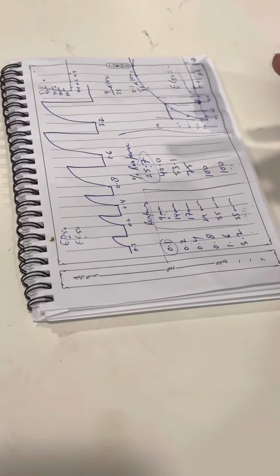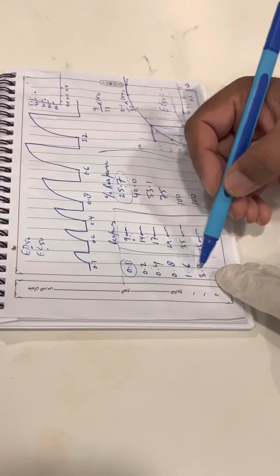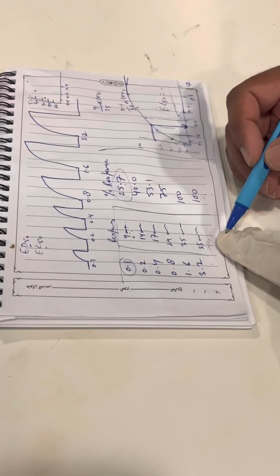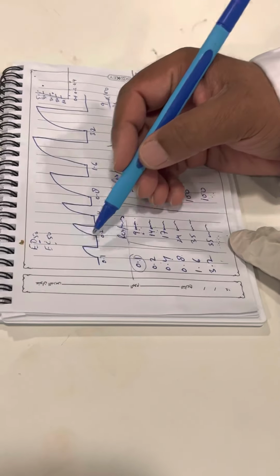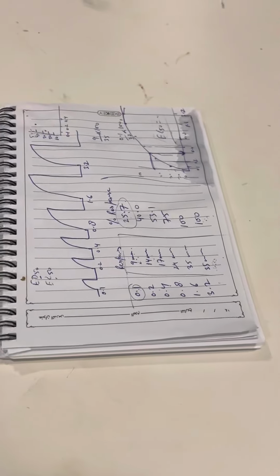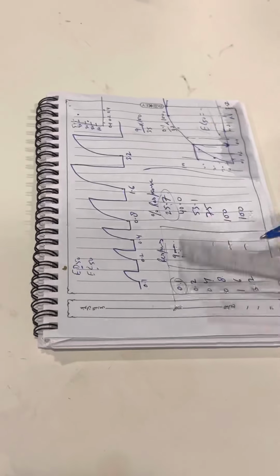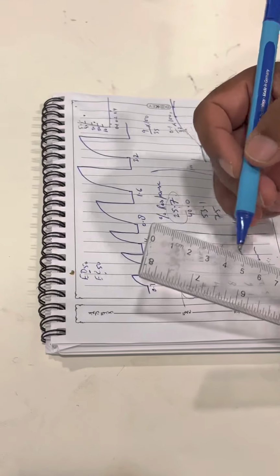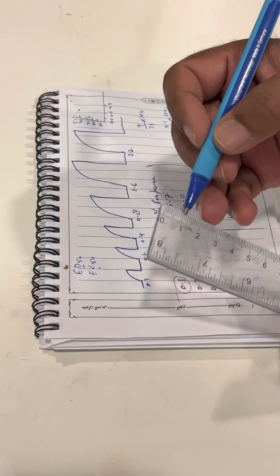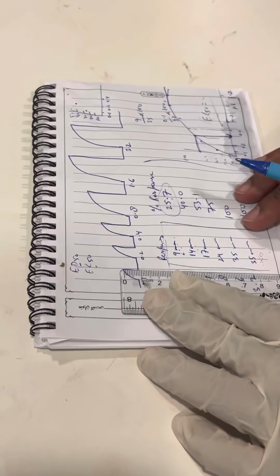This is your dose response curve. From this you can make two columns: one is the doses and the second one is the response. This response you can measure by using the ruler. Here they are in centimeters, 1, 2, 3, 4, and in 1 centimeter you have 10 millimeters. So measure this one.